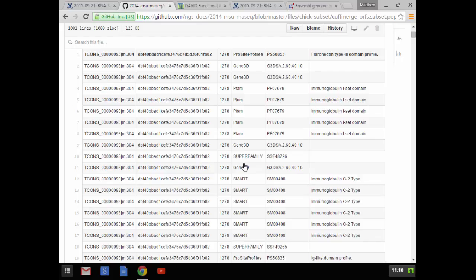Right, so InterProScan is a tool that we should have installed if we don't already. So if you're going to be doing this, feel free to ask us to help you. It takes protein peptide sequences. Here's the name. Here's some fancy text. Here's how it decided what it got, and here's what it thinks it does.